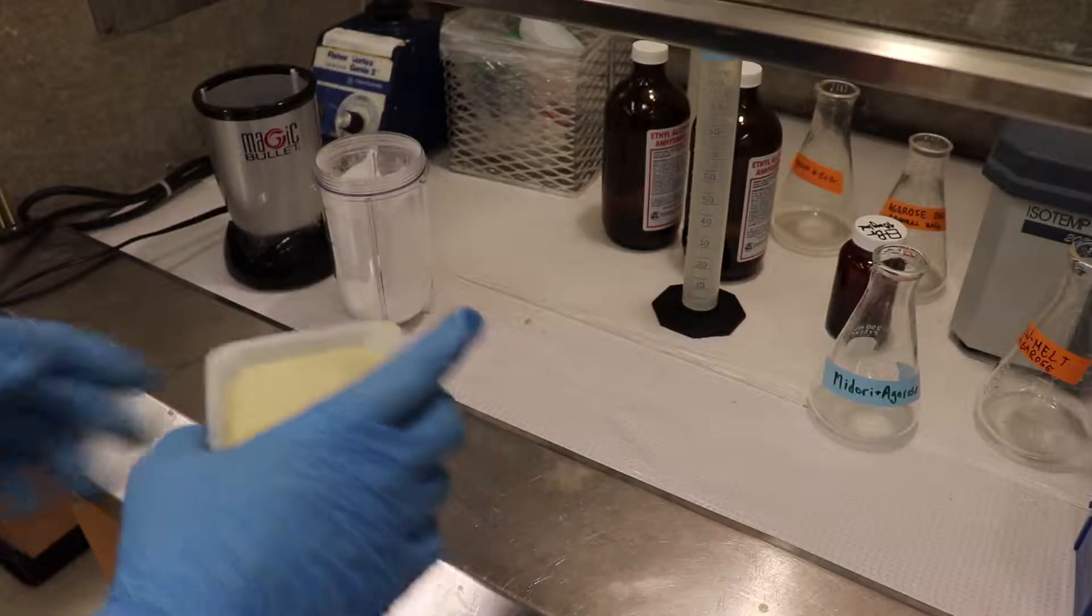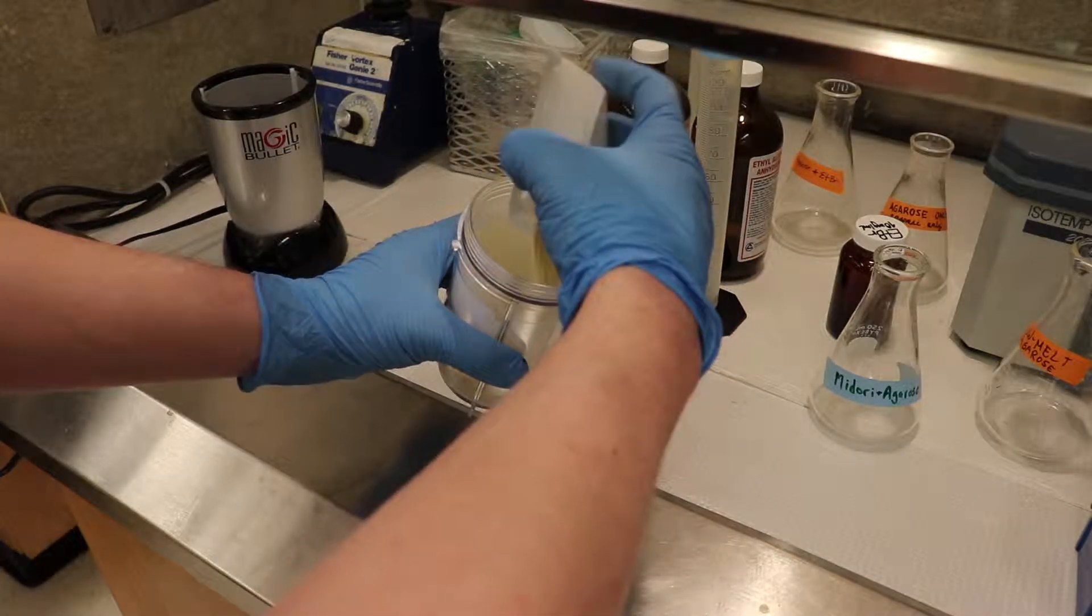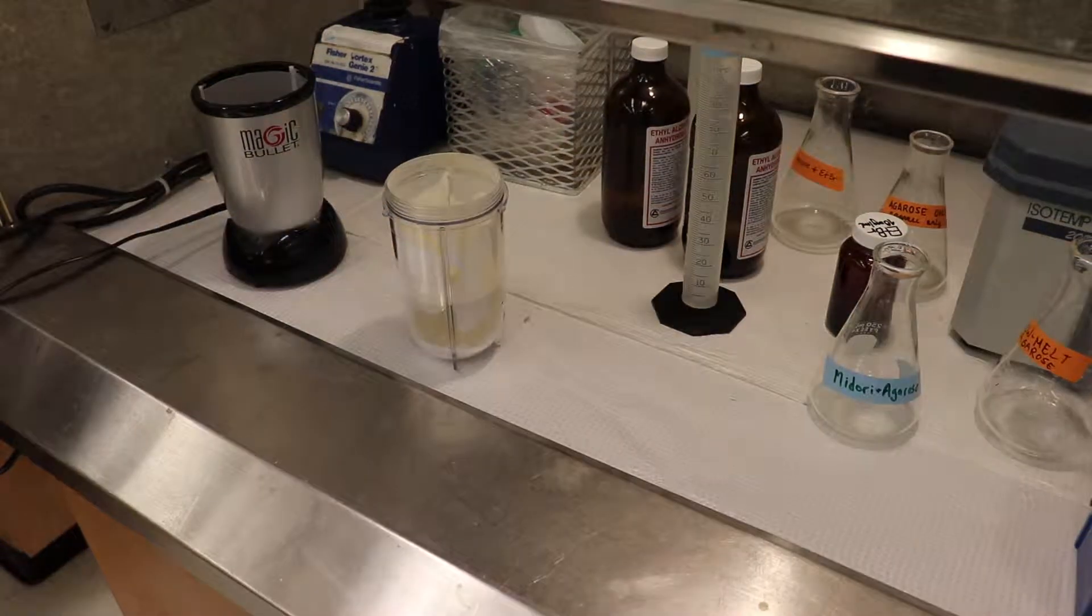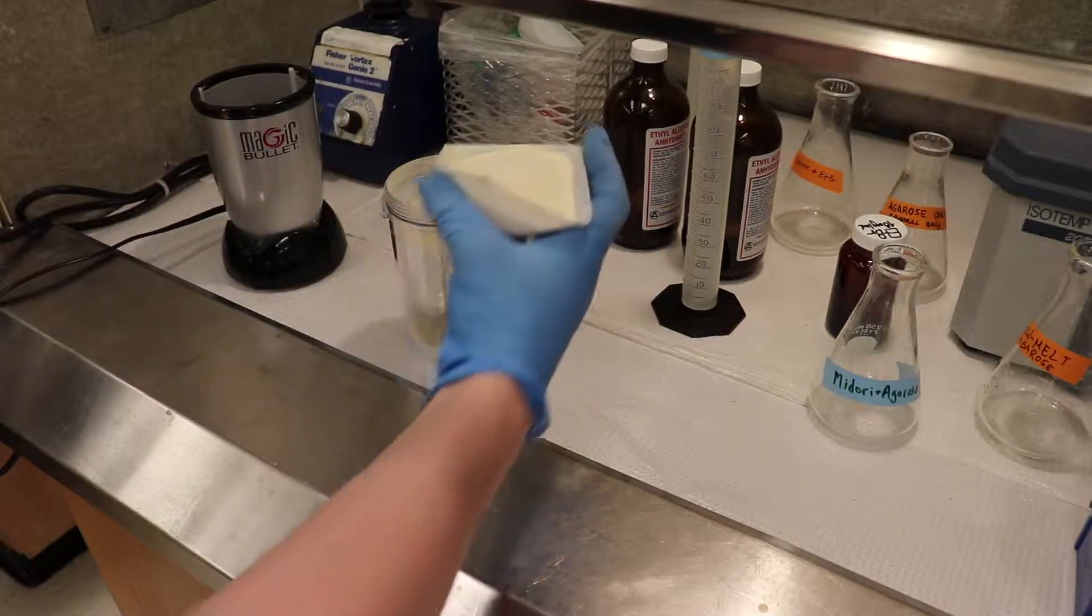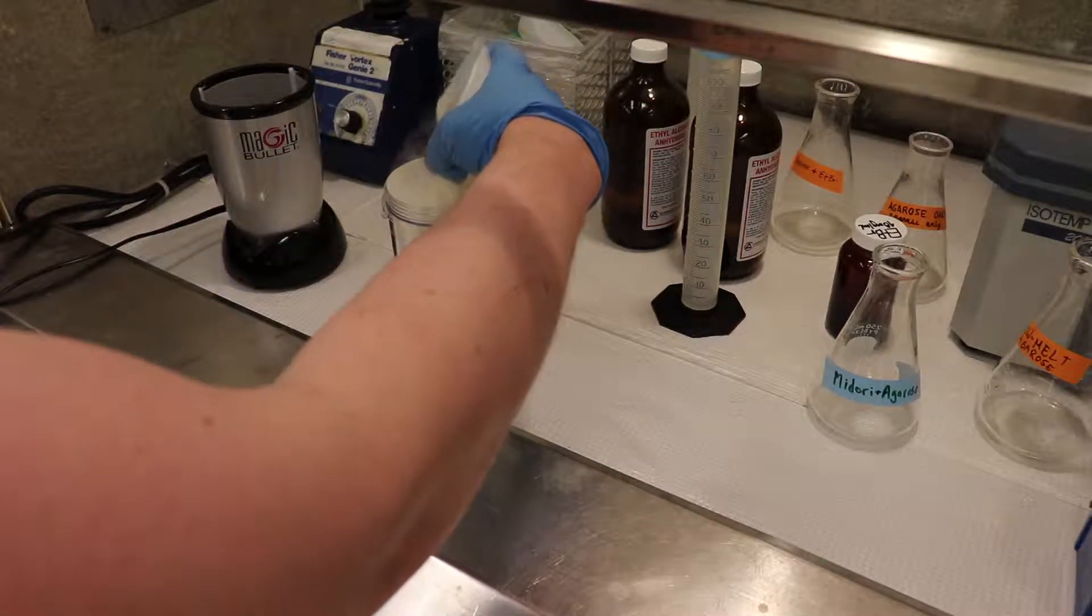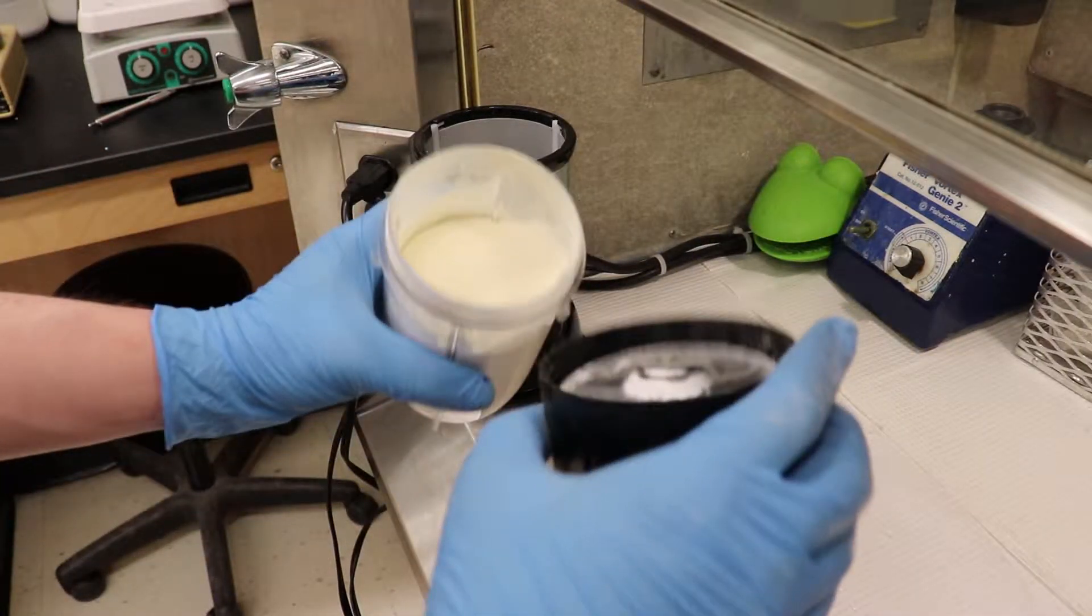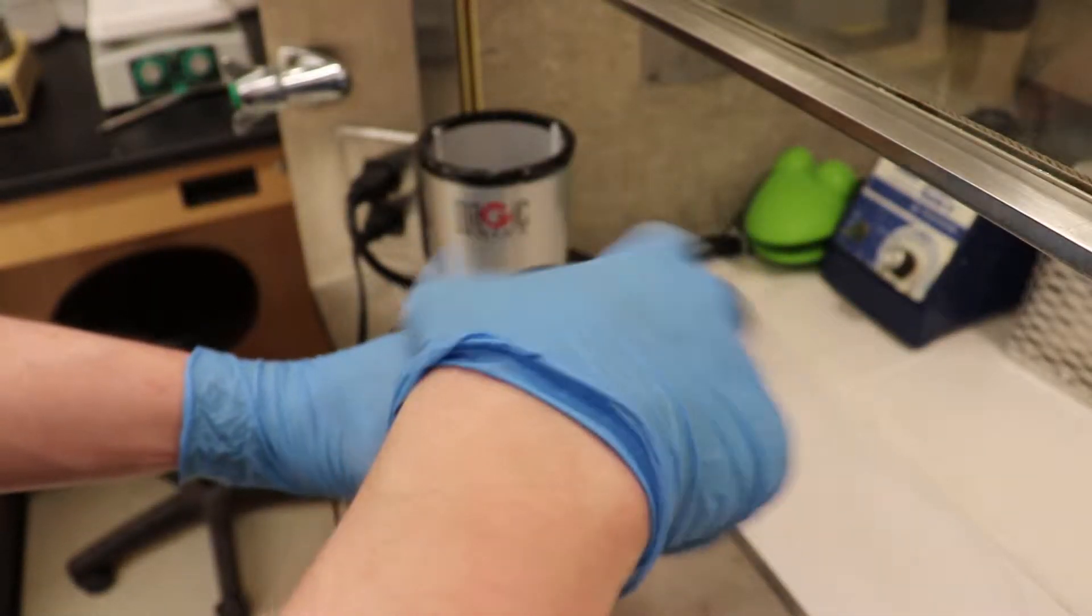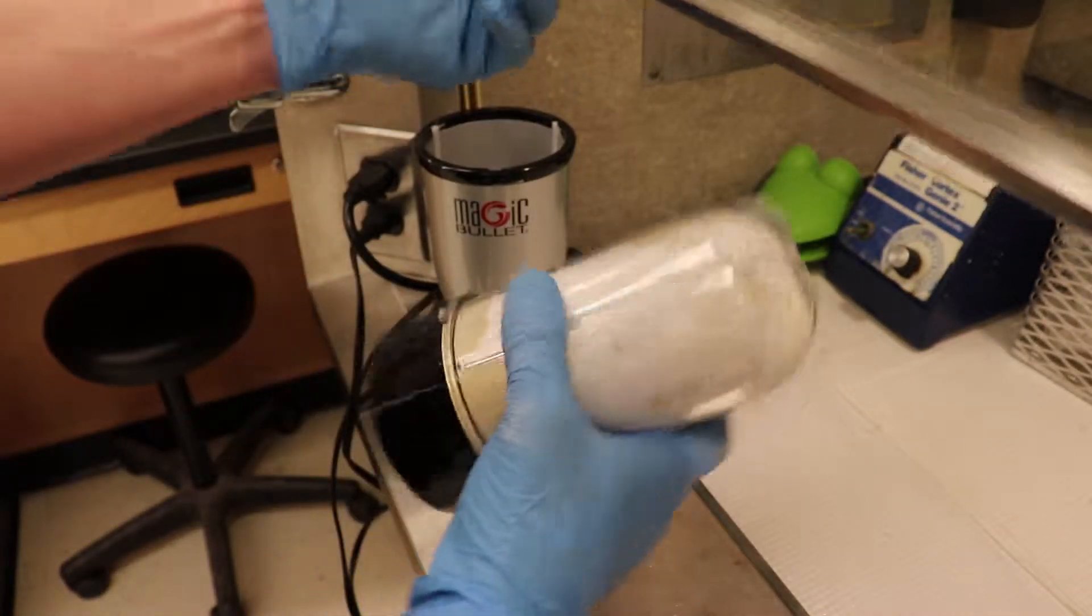So in goes the yeast extract. And in goes the tryptone. Cheers! When you've added all your ingredients, then you just cap it up. And blend it until it's homogeneous. So we'll use the blender to do that.